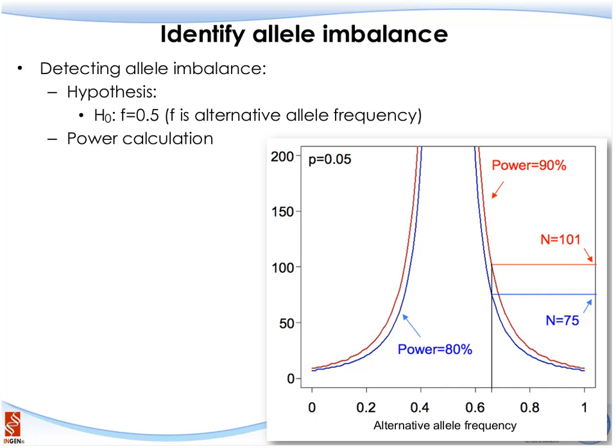And as people who work a lot on RNA sequencing experiments know, for some of the very highly expressed genes, probably 100 sequencing reads to cover one genomic location is not a big deal. But this is not true for most of the genes, which have moderate or somewhat low expression levels. If we really want to capture the allele-specific effects of low or moderately expressed genes, we really need to think about increasing the sequencing depth. So those are the considerations you might need to have at the experimental design phase.